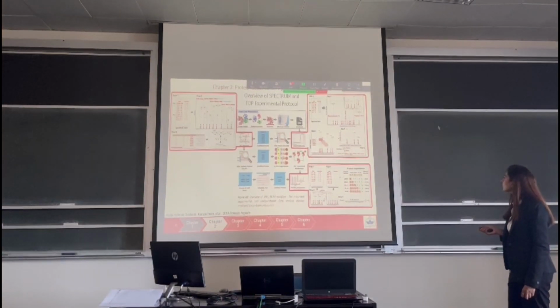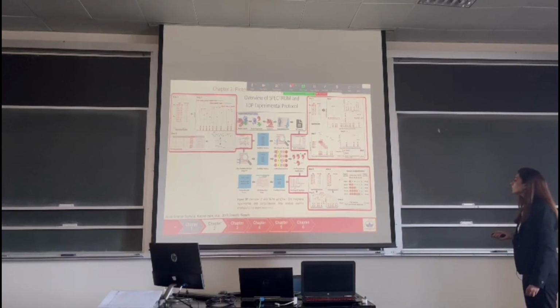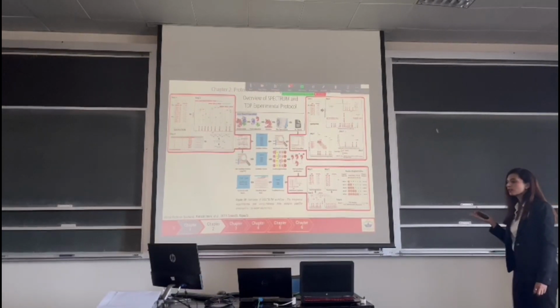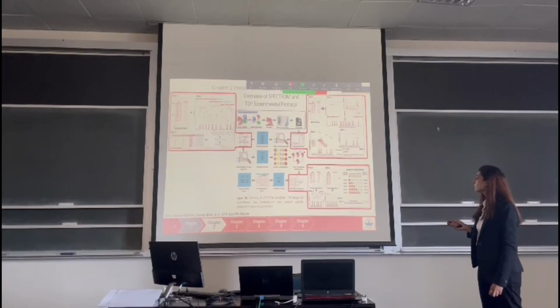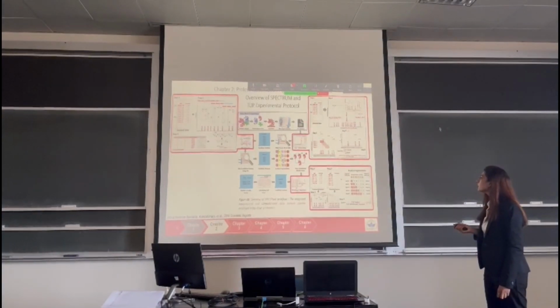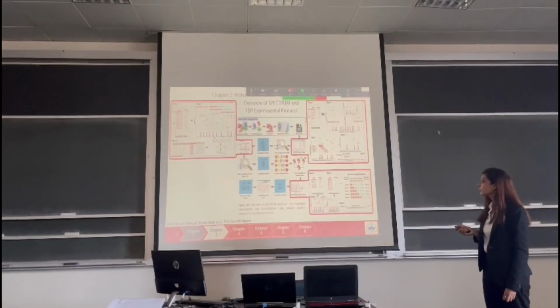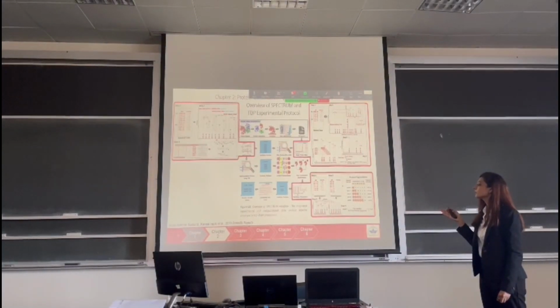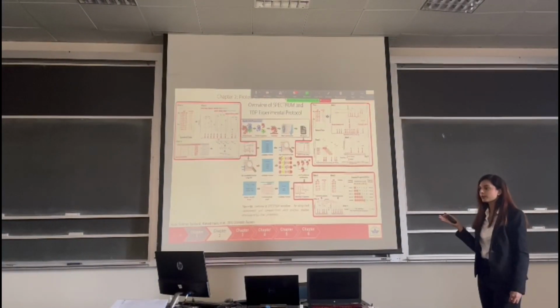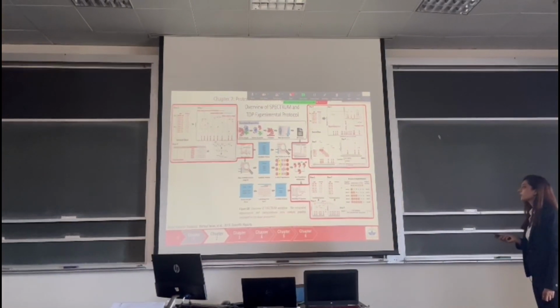These matches are then used to formulate the in silico score, which is then used to filter out the candidate protein list. The updated candidate protein list is then ranked and scored using the composite scoring scheme, which assigns weight to the particular algorithms based on what the user has specified, as a result of which the proteins are ranked and scored. Spectrum offers a range of UIs for visualization of search results.